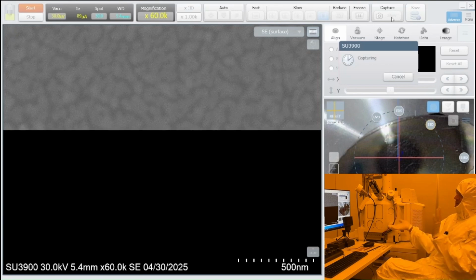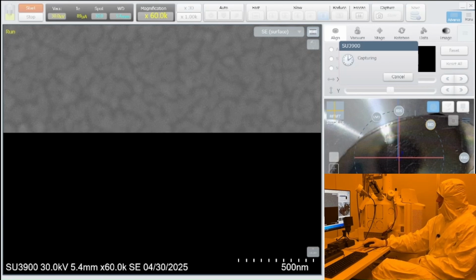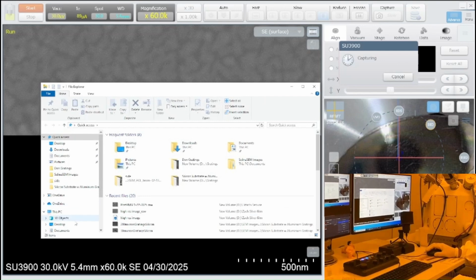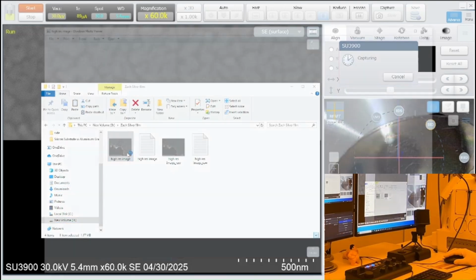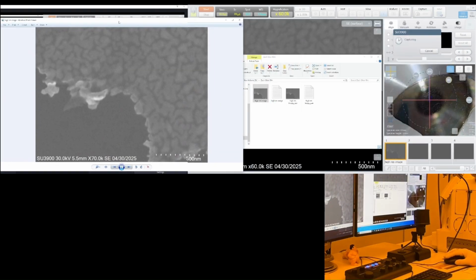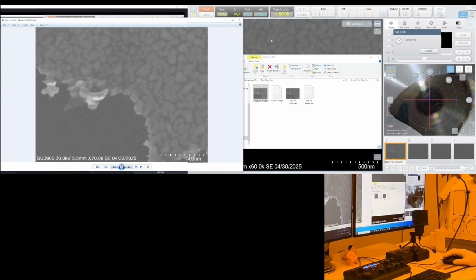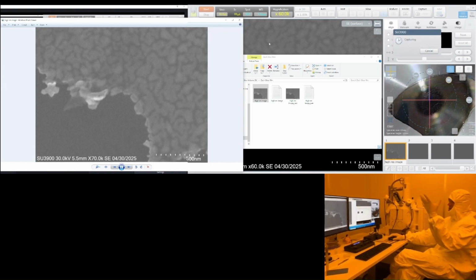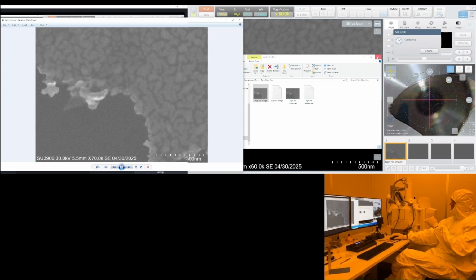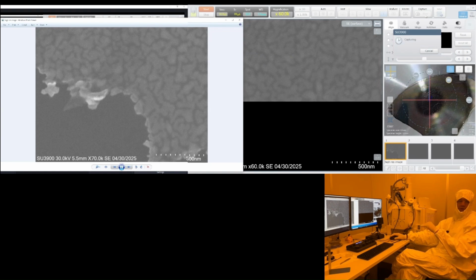So this is 30 spot size. I think 20 might be the best bet for this sample spot size. Yeah, I think 20 gives us our best resolution and our best signal. But you want to do a really slow capture. I'm doing a 256 second capture. Wow.